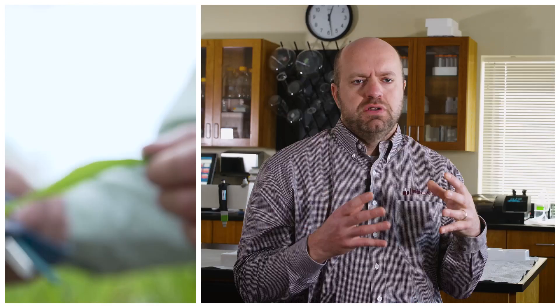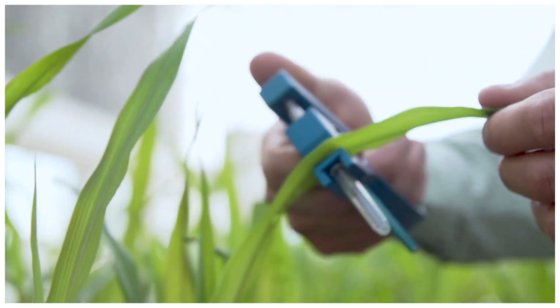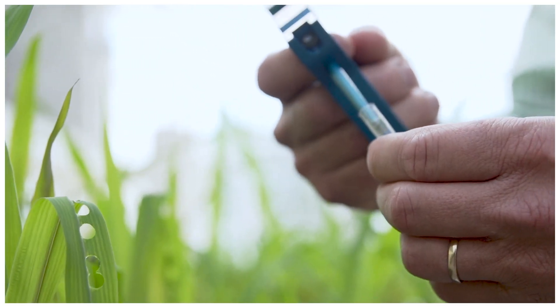We start by taking either a kernel or leaf sample and extract DNA, pulling the DNA out of the cells and suspending it in a solution.